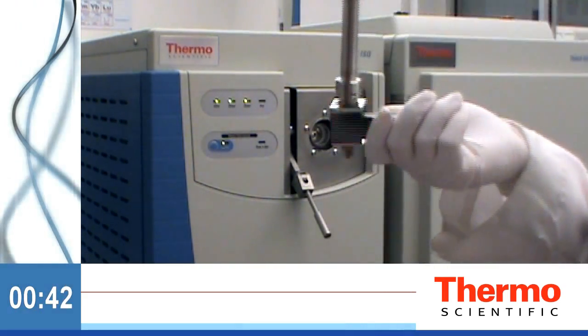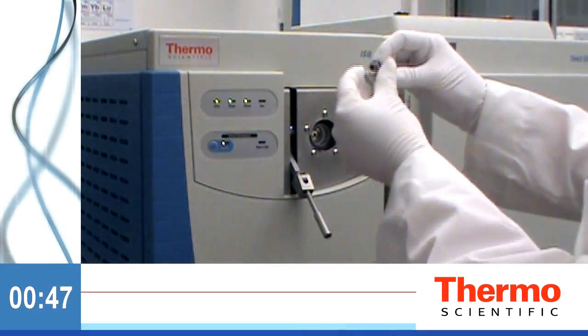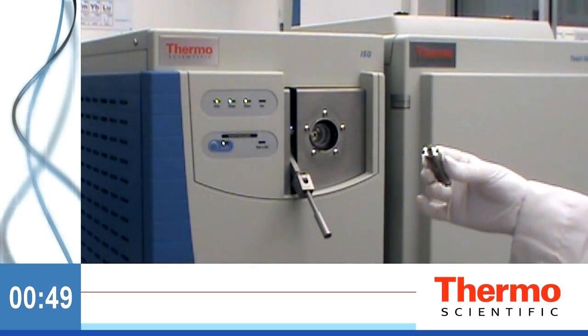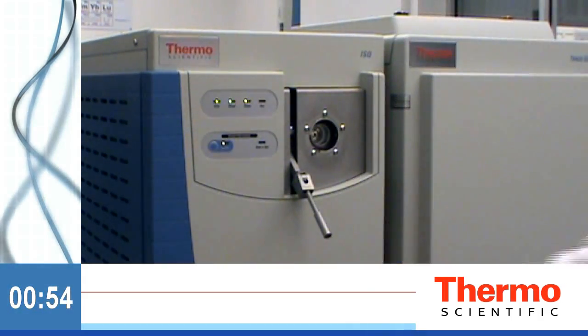Close the valve and remove the tool. Yes, the source is hot, but a simple tool allows you to safely remove the source and set it to the side. Replace the source with a clean source and reattach the source removal tool to the ISQ valve.